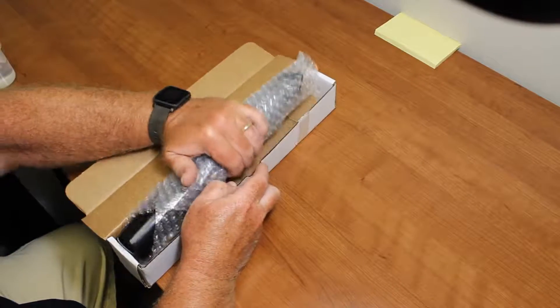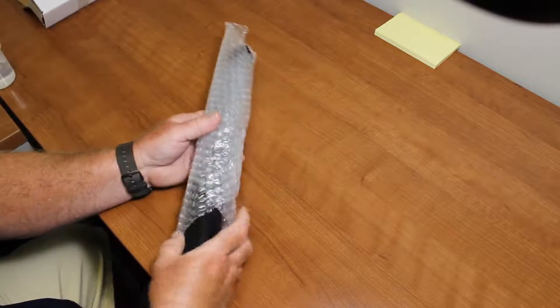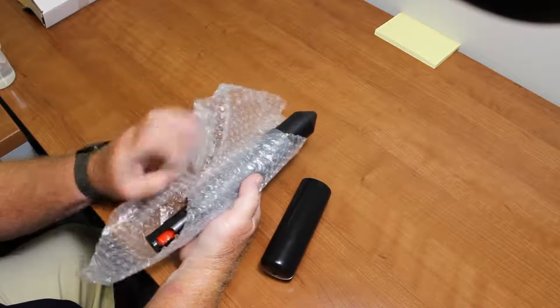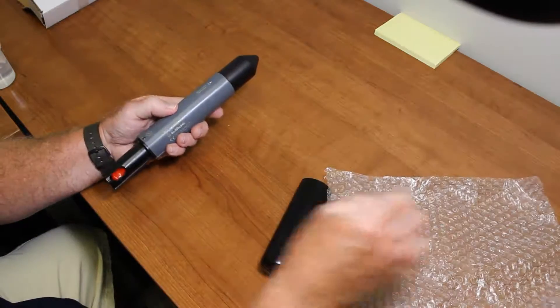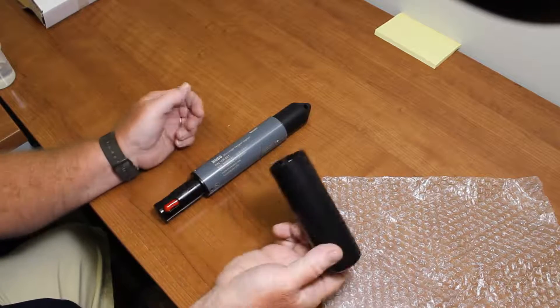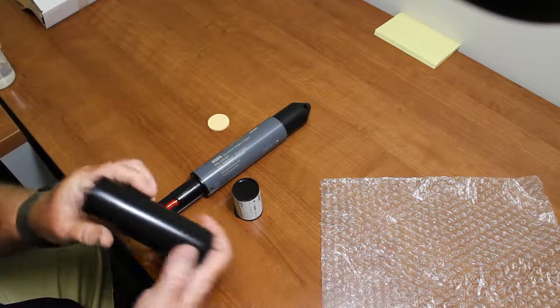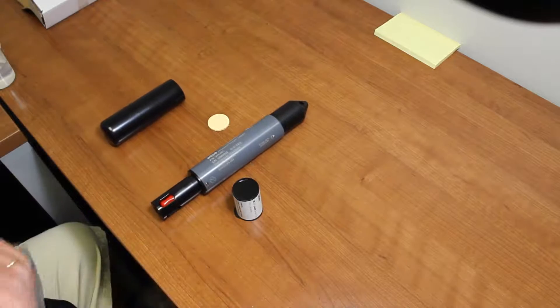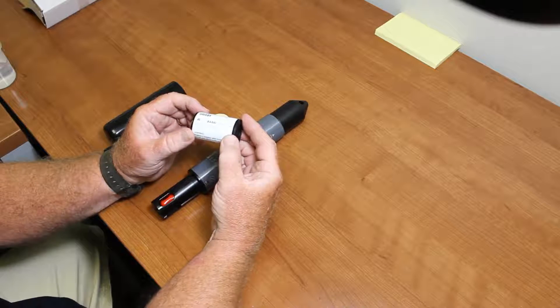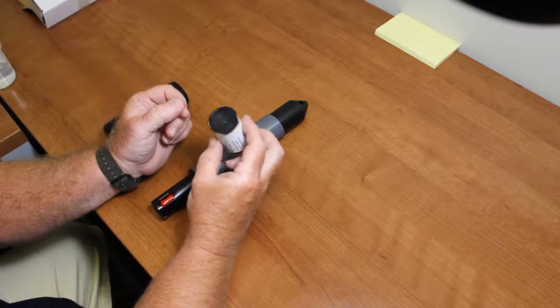Here's our data logger and the packaging out of the way. This is our calibration boot. Inside the calibration boot is the sponge. To calibrate the device, add 100% water-saturated air. The other thing you'll see in here is a small film canister — this is the sensor cap. This is kept in here to protect it from light during storage.